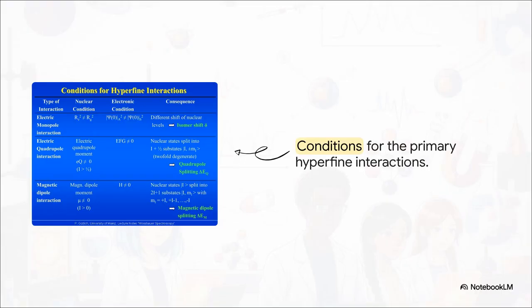So once we have our machine running, we get a spectrum. Here we can see the 3 primary hyperfine interactions that perturb our nuclear energy levels. This is basically our fundamental roadmap for reading that spectrum. We've got electric monopole interactions that lead to isomer shifts, electric quadrupole interactions causing quadrupole splitting, and magnetic dipole interactions which give us magnetic splitting.